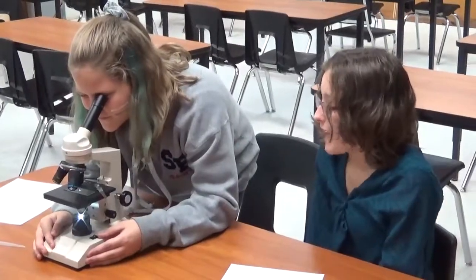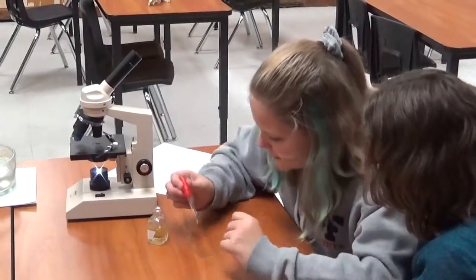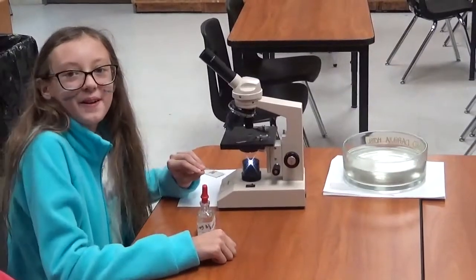First, we're gonna do our control Daphnia in plain water. Next, we're gonna add our manipulated variable. I'm gonna add a bit of Monster Energy drink to see how that affects heart rate. I'm going to add rubbing alcohol.